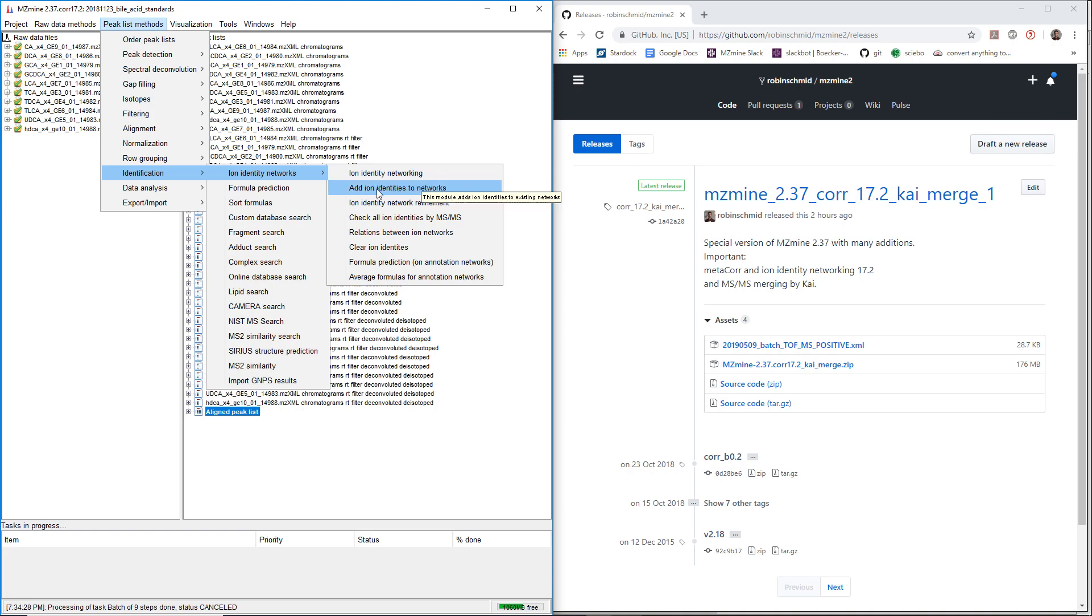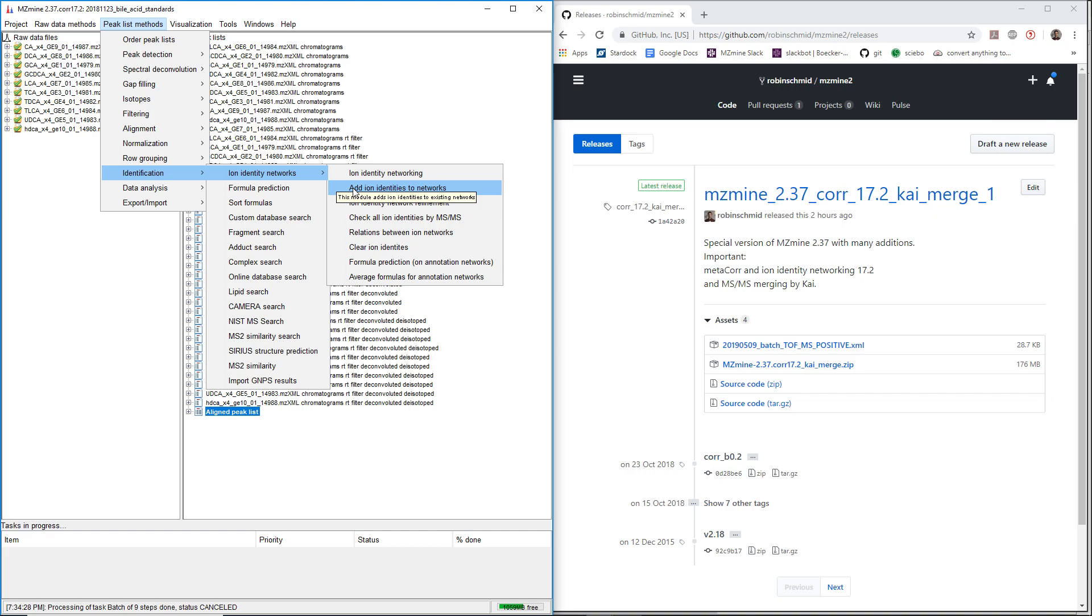After that, you can add different ion identities to existing networks. This module is supposed to just broaden our networks.